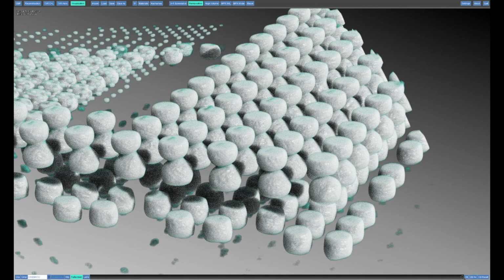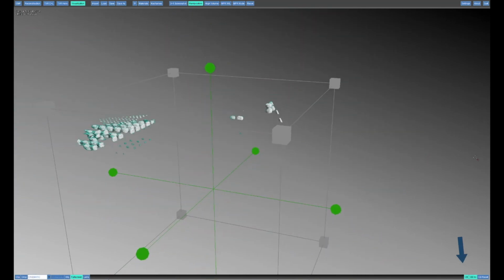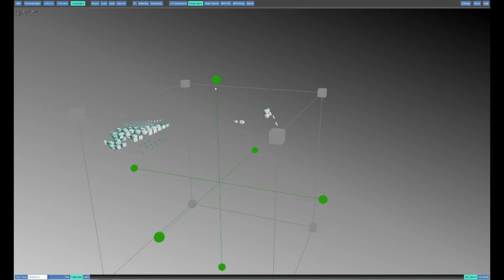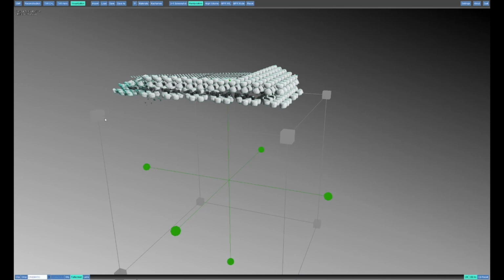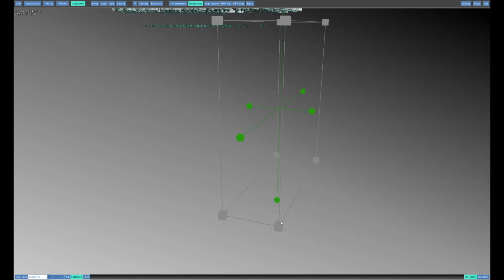In the last volume I have used the clipping box to reduce all features I don't want to see, like this one here. But we can create also an inverted clipping box. In the beginning the clipping box is very big, but you have to minimize it. This is what I'm doing now. Just move it, just make it smaller, nothing else.